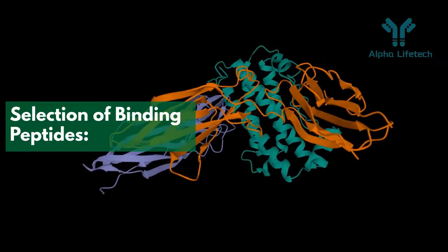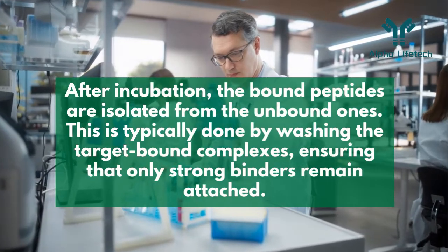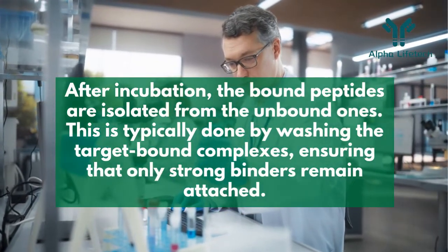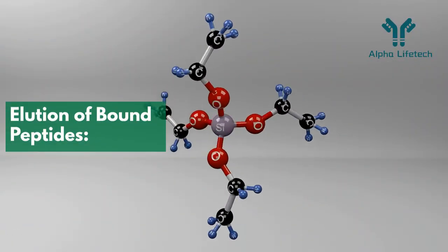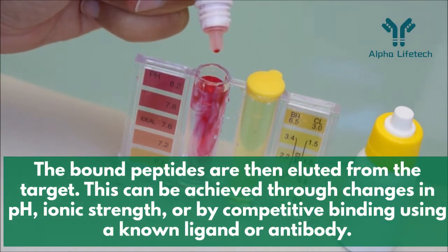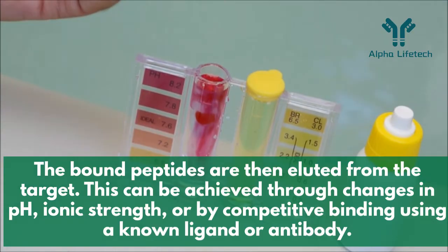Selection of binding peptides. After incubation, the bound peptides are isolated from the unbound ones. This is typically done by washing the target-bound complexes, ensuring that only strong binders remain attached. Elution of bound peptides. The bound peptides are then eluted from the target. This can be achieved through changes in pH, ionic strength, or by competitive binding using a known ligand or antibody.